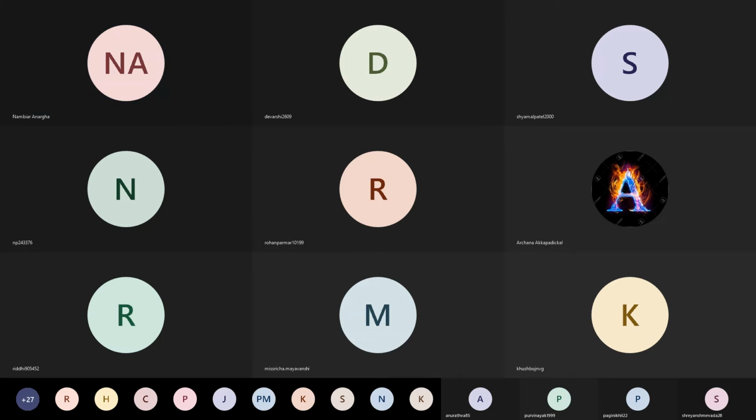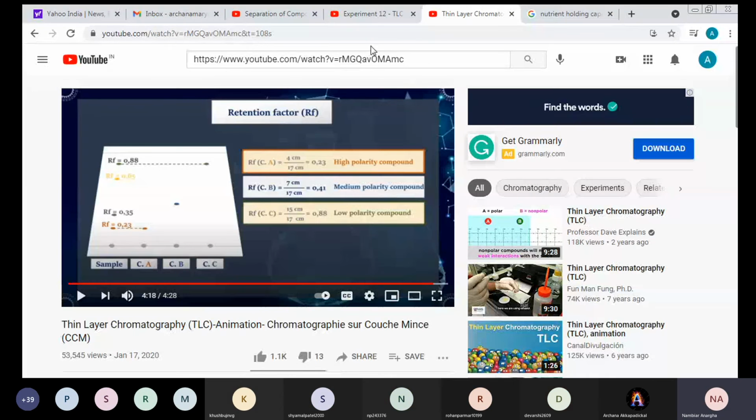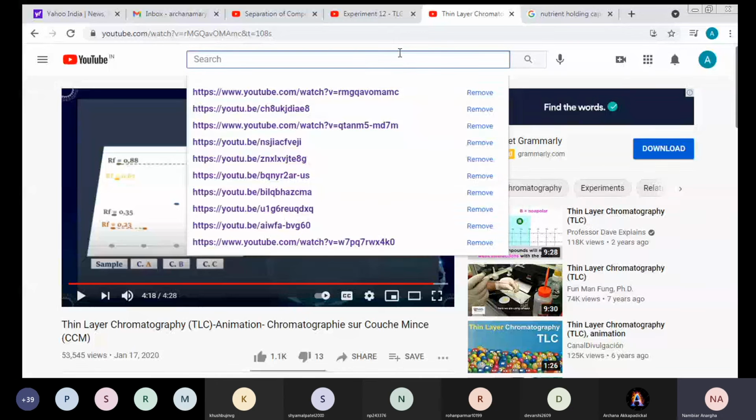No, ma'am. Is everything clear about what TLC is? You will have a brief discussion about what TLC is, and you will dig into it because you have a unit exclusively in your syllabus, chromatography. However, the TLC part, which is there in your practical session, I guess is very clear to you. So we have the video over here.